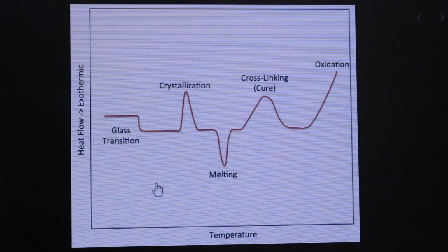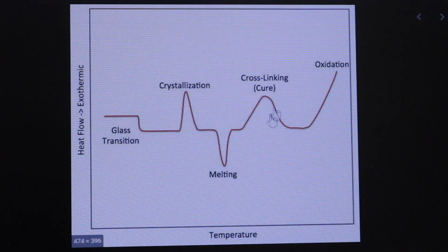Differential scanning calorimetry can be used to measure a number of characteristic properties of polymeric samples. Using this technique, it is possible to observe melting, crystallization, glass transition, as well as the study of oxidation and other chemical reactions that take place in a material as a function of temperature.